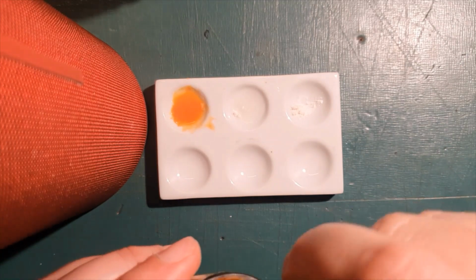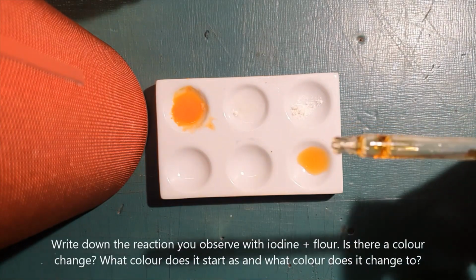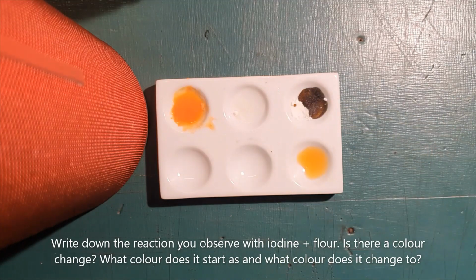And the last one, reaction to iodine. Now remember, the iodine looks like that. So you can write that down in your observations. Iodine is like a yellowy brown liquid. But when you mix it with certain things, oh, look at that. It did the same thing that it did with the starch.